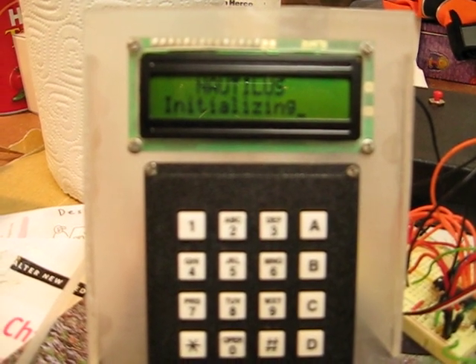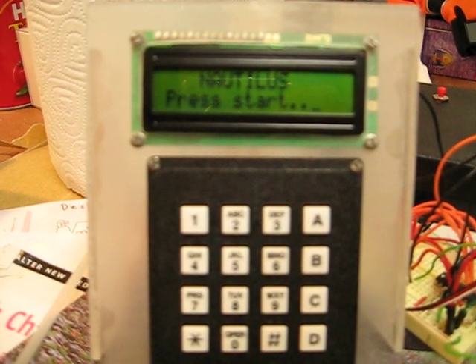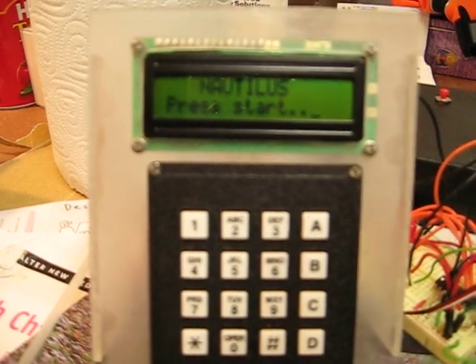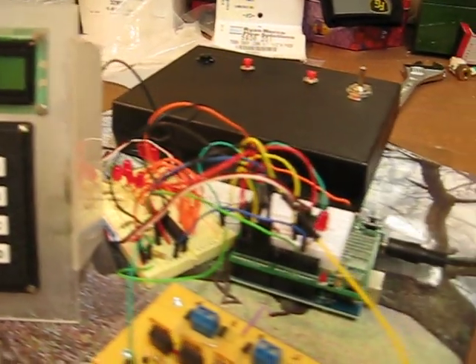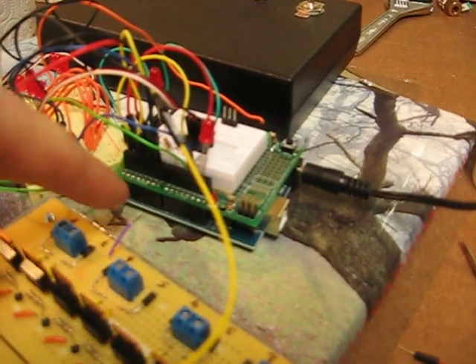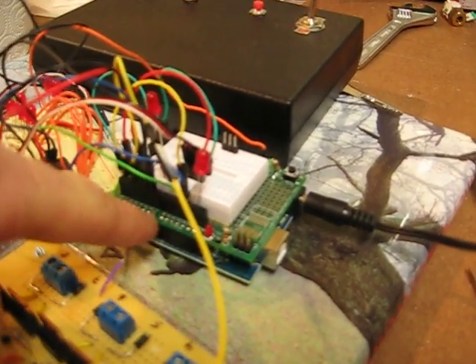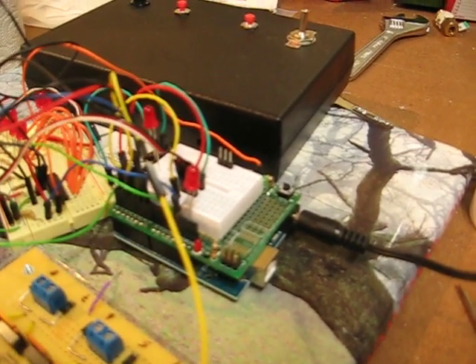This is Nautilus, an underwater sampling system. Here we have an LCD with a keyboard input connected to an Arduino board with an Adafruit shield on it.